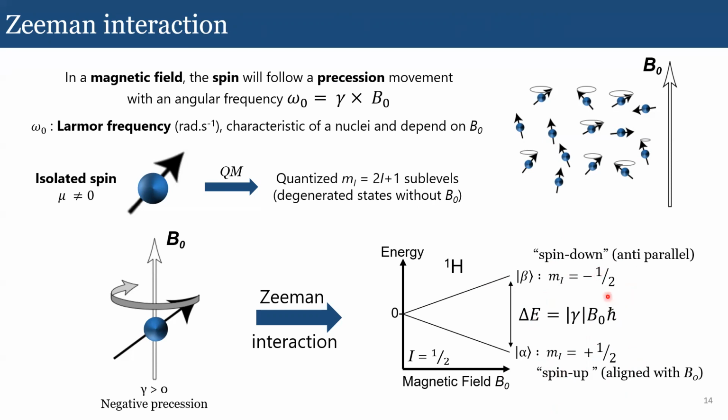You might know that already, but these types of arrangements are not fully random, because the energy of each state is slightly different. In fact, the alpha state is preferred. If you consider now the energy difference of the alpha and beta states, pictured here and denoted delta E, delta E is going to be proportional to the gyromagnetic ratio, the strength of the magnetic field, and also the h bar constant.